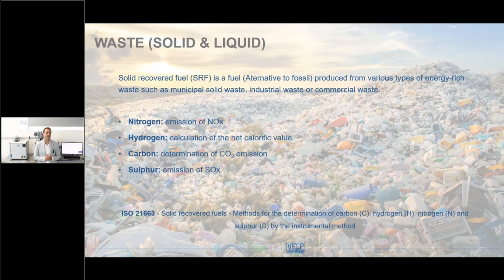Another important application is the measurement of solid and liquid waste. Waste-to-energy plants burn municipal waste, typically called garbage or trash, to produce electricity. So solid waste and liquid waste are energy-rich samples.